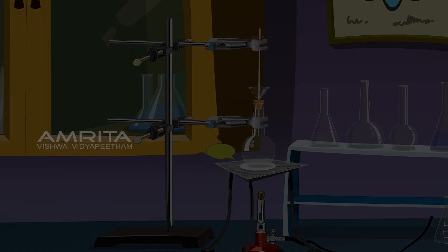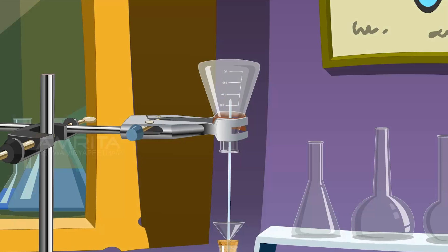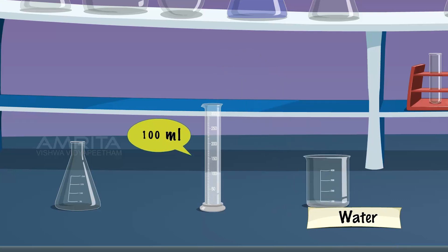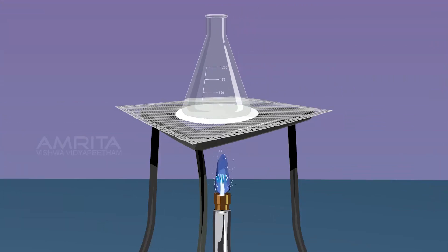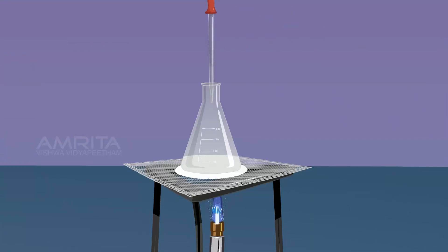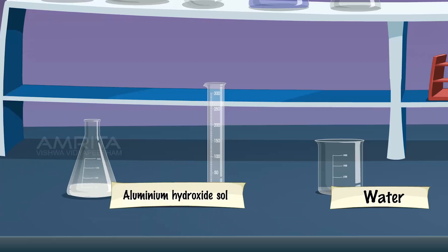Procedure: Take a 250 ml conical flask and clean it by the steaming out process. To this cleaned conical flask, add 100 ml of distilled water. Heat the conical flask containing water to boil by placing the flask over a Bunsen burner. Take 2% aluminium chloride solution using a dropper and add it dropwise to the boiling water. Continue boiling until a white gelatinous solution of aluminium hydroxide is formed. Keep the contents of the conical flask undisturbed for some time at room temperature. Label the solution as aluminium hydroxide sol.